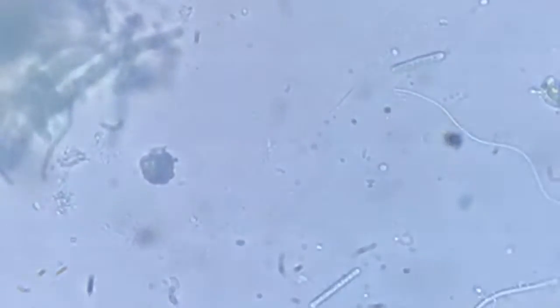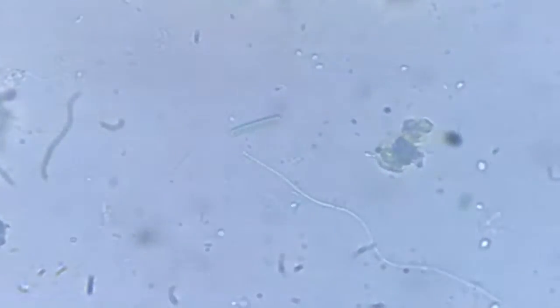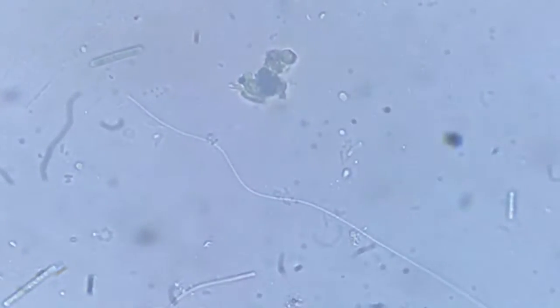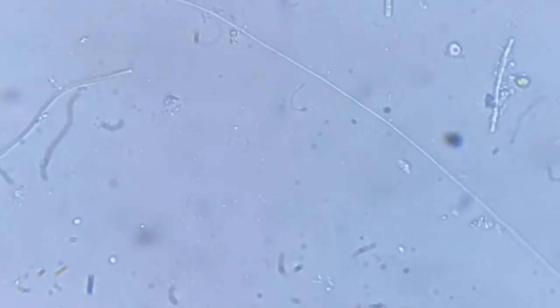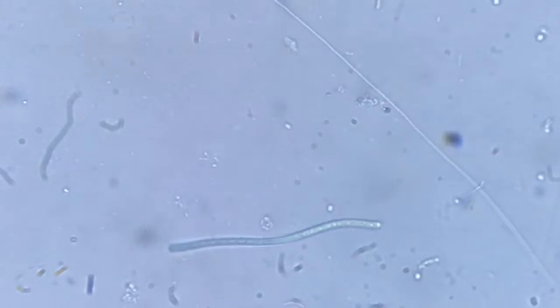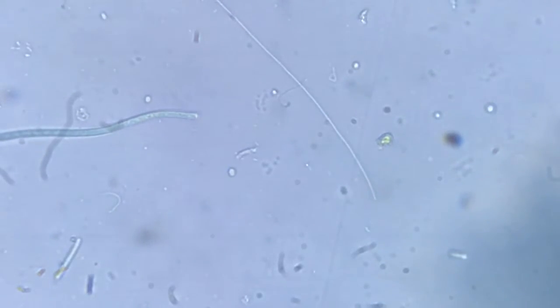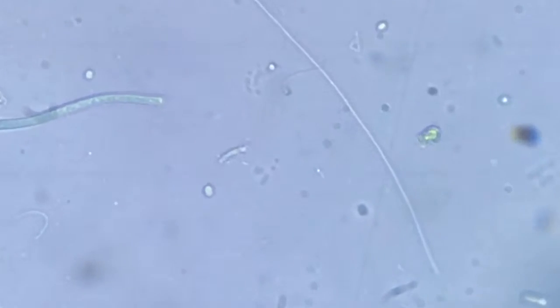So yesterday I had seen this worm and I am still highly perplexed about its identification. There you can see it at the right-hand side of the screen, a wavy structure, whitish, and it's very long compared to its width. You can just make out, just imagine how big it is. We are observing it at 400, it's around 500 times magnified. I'll still zoom it a bit more.